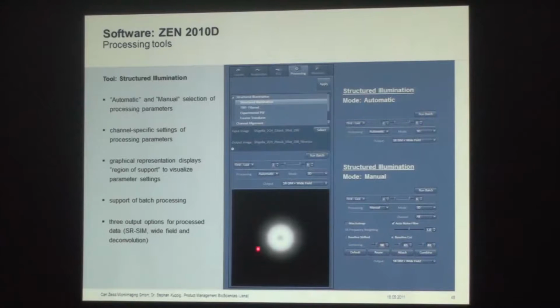These are all with reference to how you shape the modulation in the different phases, how intense they are, how you extract the high frequency, amplify the high frequency and suppress the low frequency. These filters can play a predominant role, and you might need to pay attention to what you're doing.